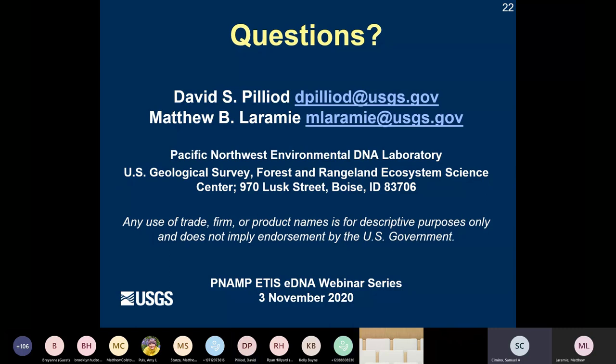Column kit? No, I don't have a recommendation on that. I'm not familiar with that one, to be honest with you. The methods that we show, though, whether it's using a kit or one of the chemical precipitation methods, you could modify those as necessary to probably work with it. I don't know if that's one that pelletizes the DNA first, but these can be adapted pretty well for most methods.